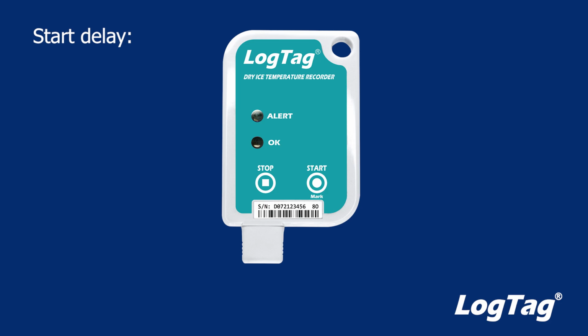If you configured your logger with a start delay, your logger will begin logging after the configured period. If you configured your logger to start at a specific date and time, your logger will be scheduled to start logging at that specific time.